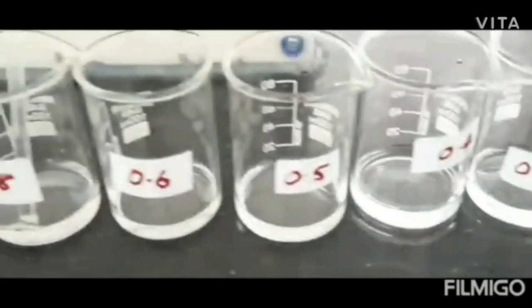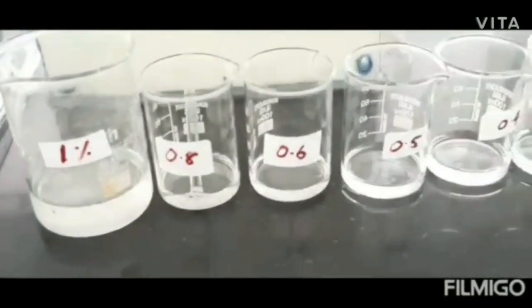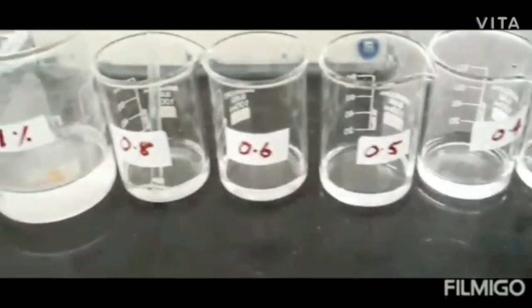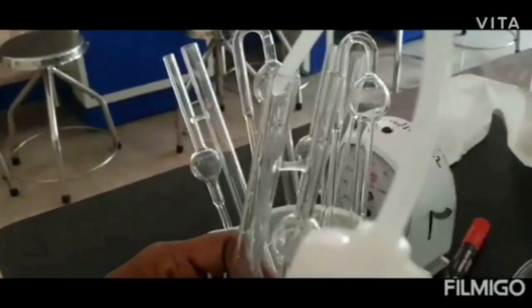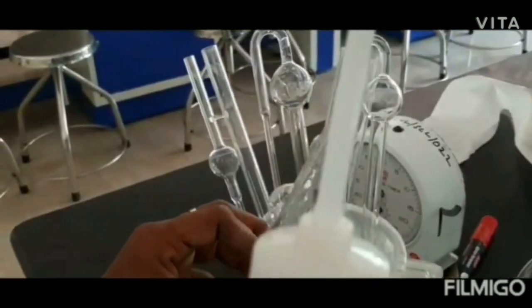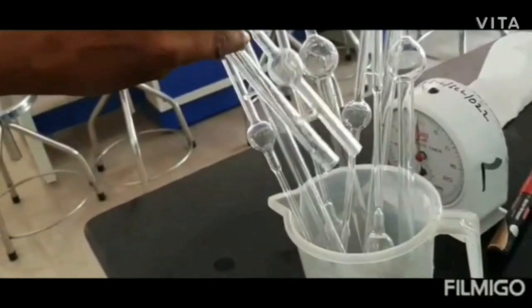Okay, then the third step is to find the flow time for the distilled water and also for the polymer solutions. For this, first we need to wash the viscometer thoroughly using distilled water.